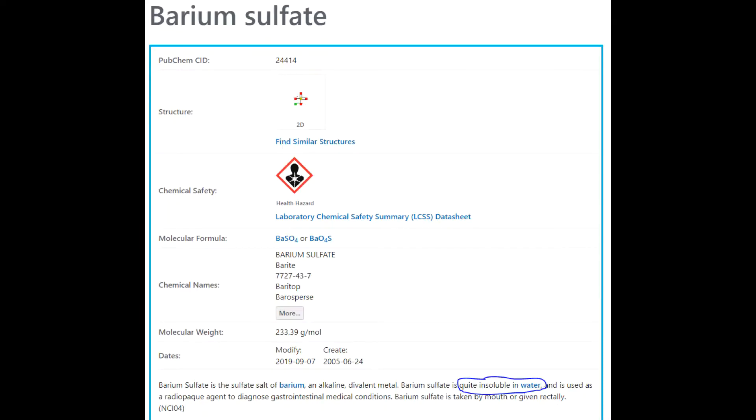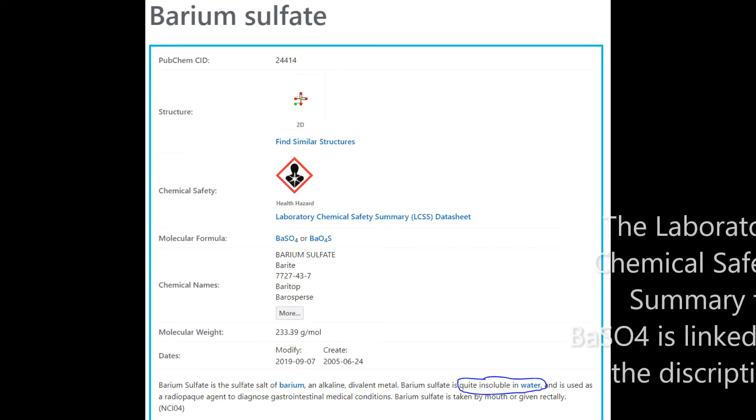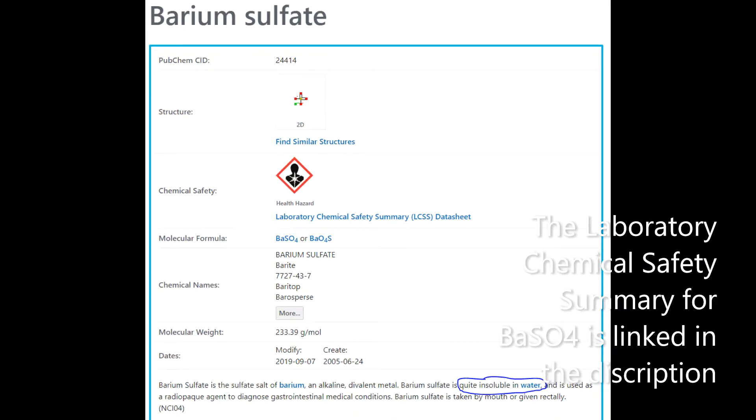If we pull up the PubChem page for barium sulfate, we quickly learn that it is quite insoluble in water, which explains why it is in suspension in the solvent. Also, note that barium salts are pretty nasty, so don't try this one at home unless you're very well versed in the proper handling of toxic chemicals.